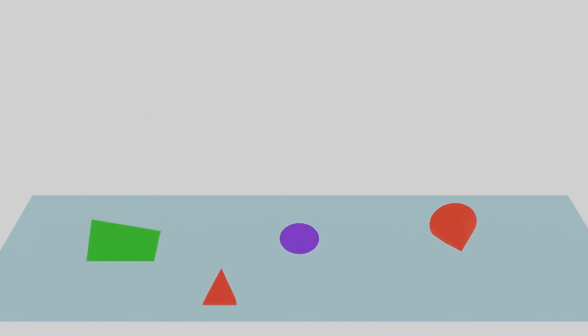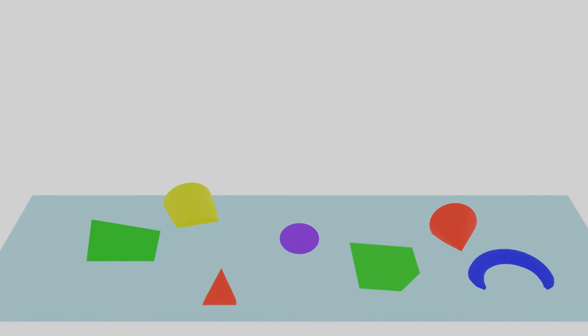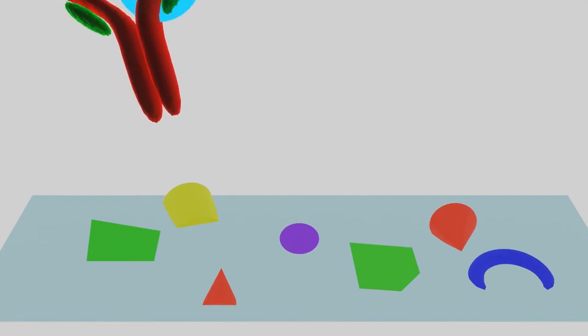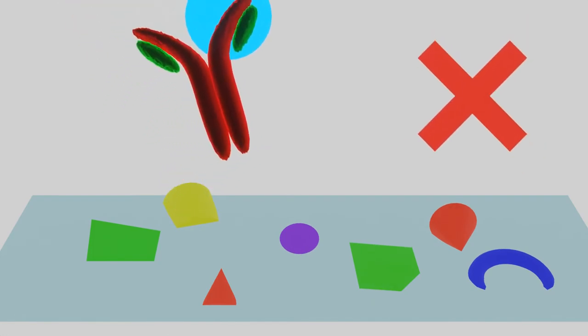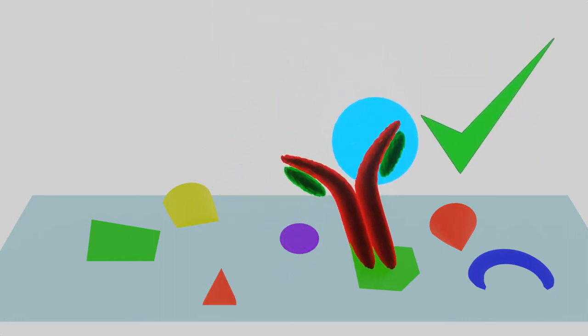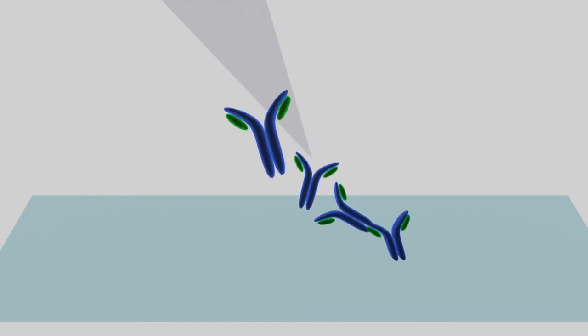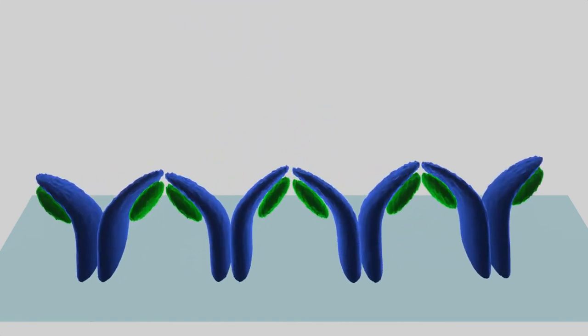First, notice that when adding the sample to the sticky surface, there is nonspecific binding. HIV, hemoglobin, albumin, pretty much any protein in your sample is going to bind to the sticky surface. This is undesirable because it decreases the sensitivity of the test. If HIV is present, it will bind, but in small numbers.